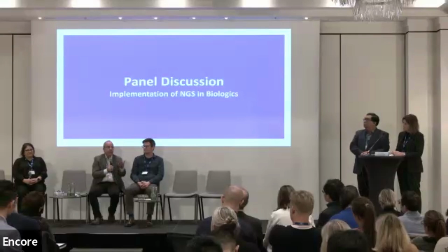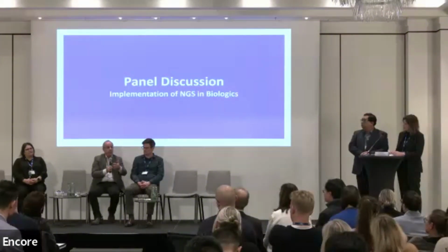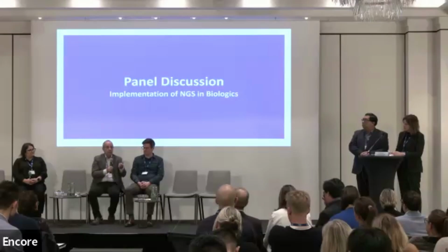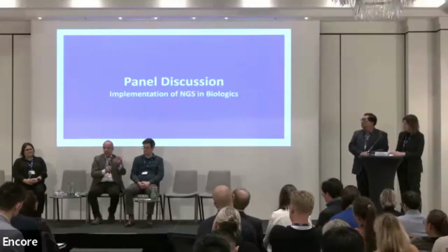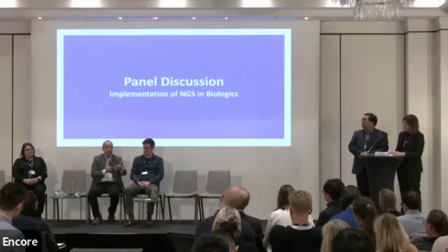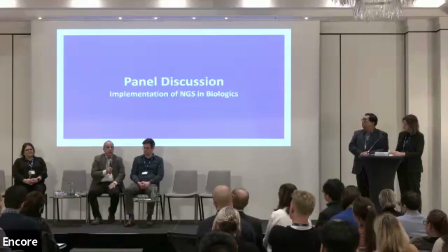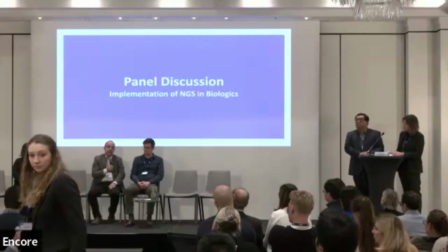One precursor to being able to do any of that is for the pipeline to be able to support that. The counter-screening step would potentially remove any of these endogenous retroviruses because they're host. So we give the viruses a handicap, if you like. If it's matching equally well to a retrovirus in RVDB or RefSeq and it's matching the host, then the virus gets a boost in its score so that it gets further down the pipeline and eventually gets resolved. So it's a multi-pronged approach before we can say that we can actually use it for retrovirus safety. Okay, thank you.